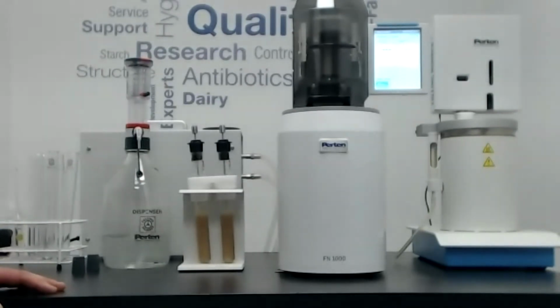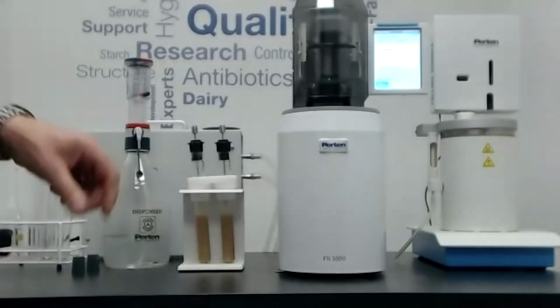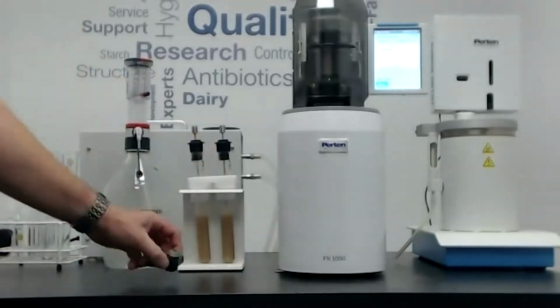Cleaning the tubes. Like I said, there's what's called the spoly tube cleaner, which attaches to a tap fitting in your sink. It's just an automatic way of cleaning the tubes. So do be careful when you're cleaning them. We know they're expensive, but they are made to a very tight tolerance. Also, when you're cleaning your bungs, make sure you clean off any residues so you can avoid cross-contamination.